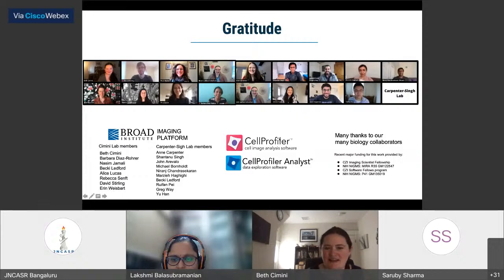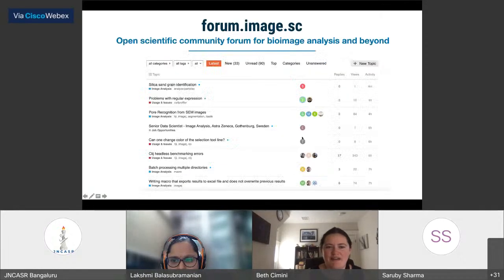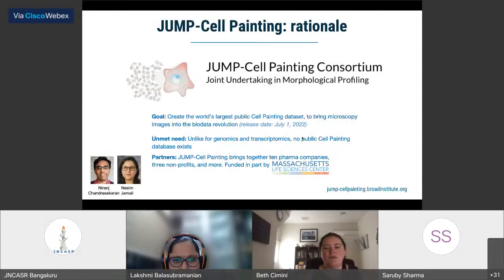I had one slide that I skipped that I'll go back to, since it seems like we might have time. One thing we are working to do is create the world's largest public cell painting data set so that people can do these sorts of querying experiments, because there are no public cell painting data sets that are queryable in the same way. If people want to do this on their samples, on the biology they care about, they can then match it against a larger database of cell painting data.